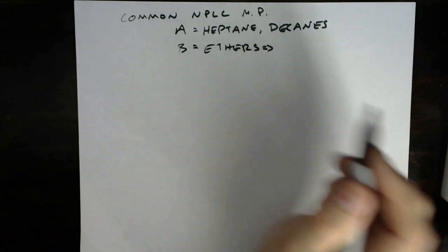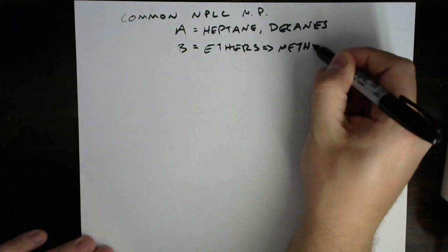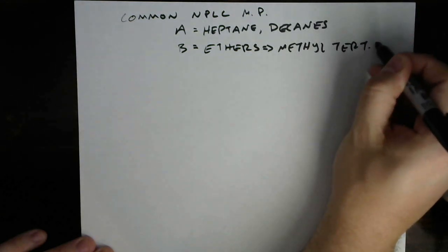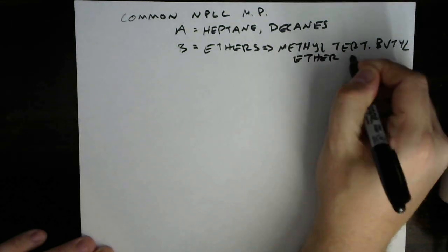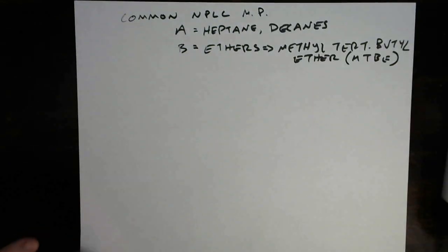A really common one is methyl tert butyl ether, or MTBE. It is often abbreviated in the literature.